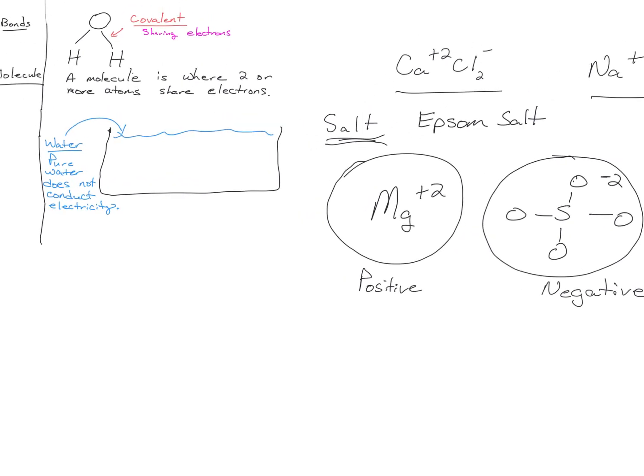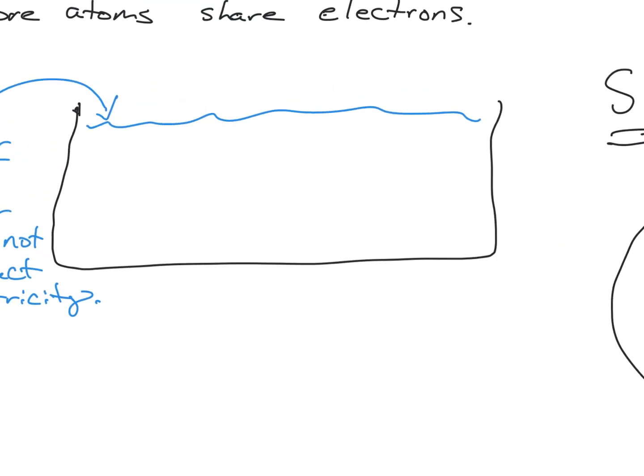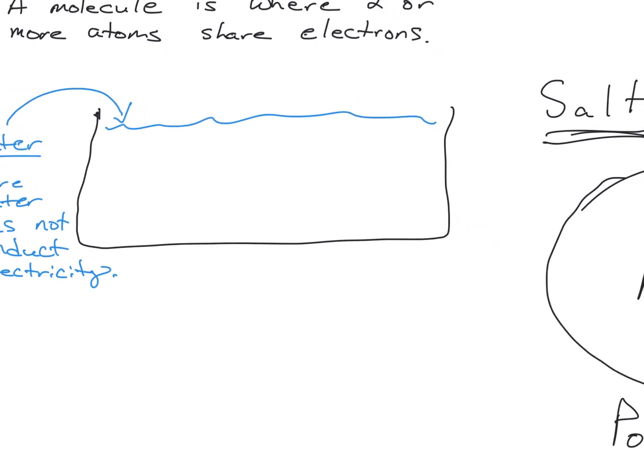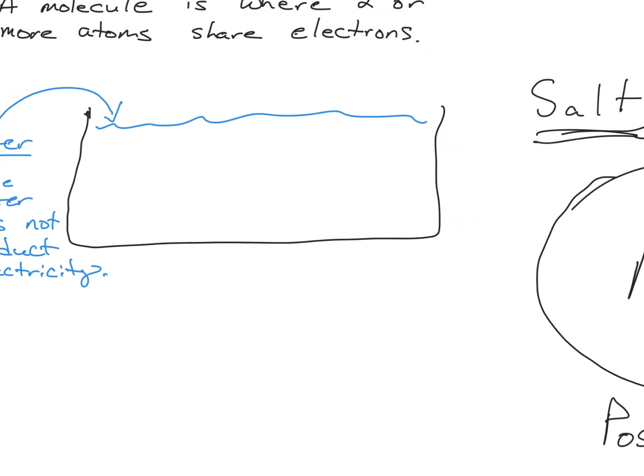All right. So all that being said, we're going to add salt to water. And when you add salt to water, I'm going to ask some of you to put some more salt in it. I will ask a volunteer to go around with the container. You can do it. And you can use the beaker and pour it in there so people get the full observational opportunity here. What you're going to do is add salt. When you add salt or sugar, either one, to water, it disappears.